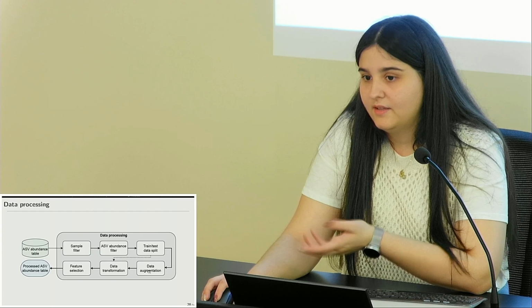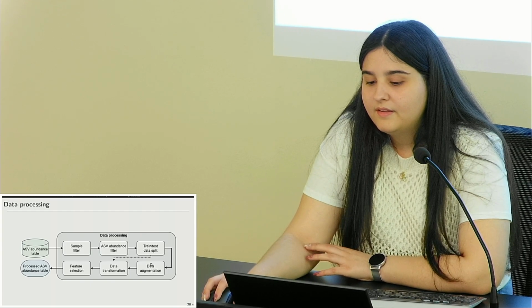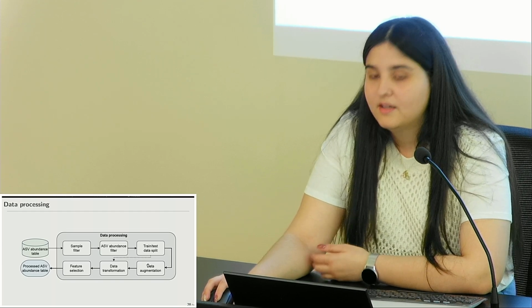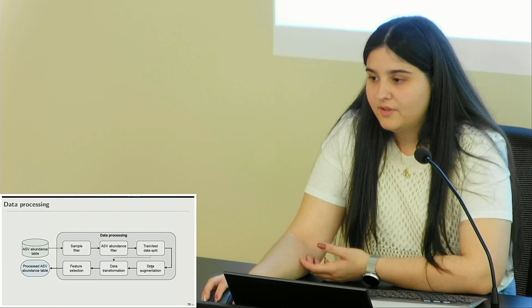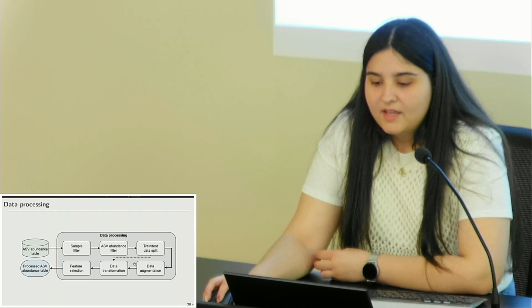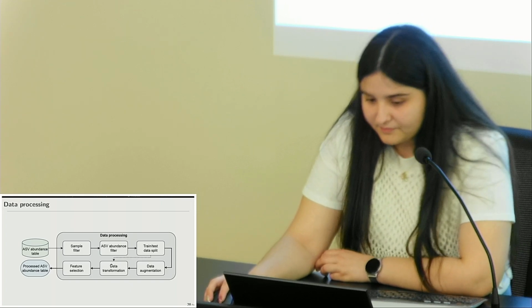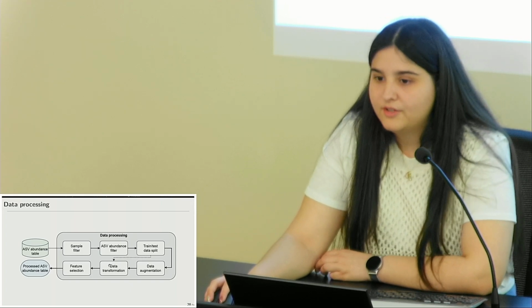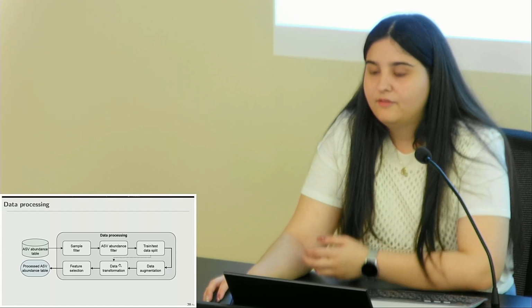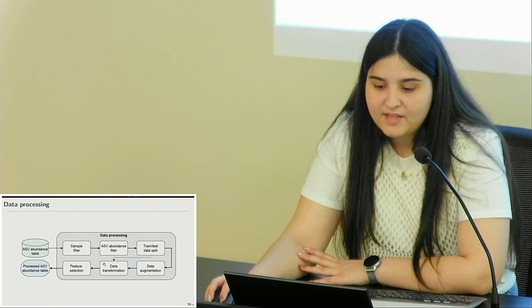If the dataset that we're using is imbalanced, we would perform this step. Here we recommend using algorithms that take into account the compositional nature of the data, so the new data points created are still compositional. Then we have to transform the data using centered log ratio transformation, which is especially recommended for compositional data like abundance tables.